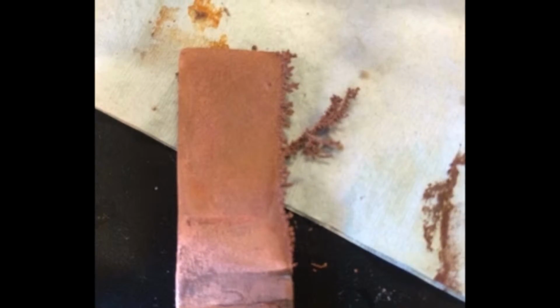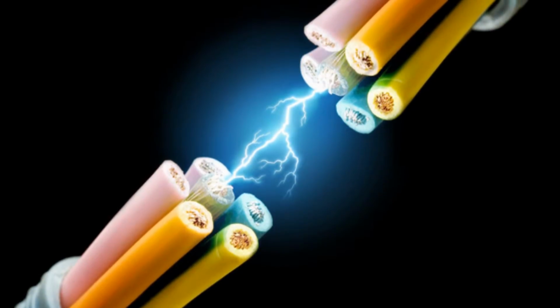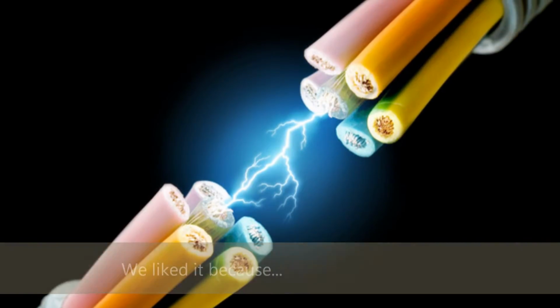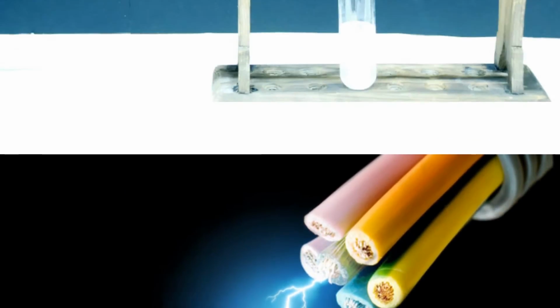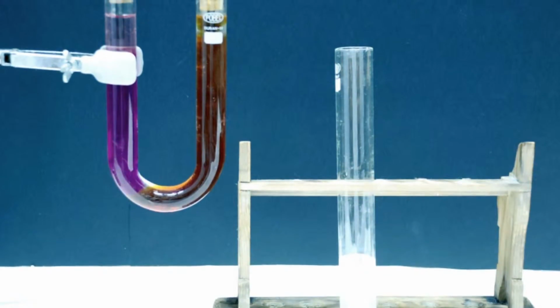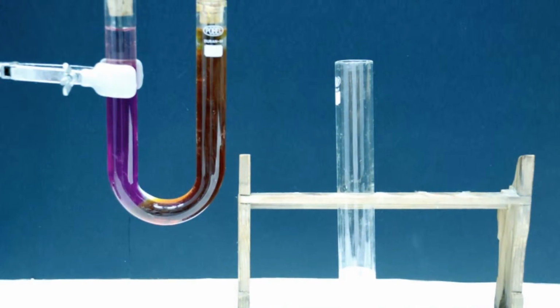The important parts of these experiments are how to identify the cathode and the anode, understand the reactions that are taking part in the experiment, and how the current affects it. We like it because it involves electricity in a redox reaction, and also electrorefining is an industrial process for the manipulation of copper.